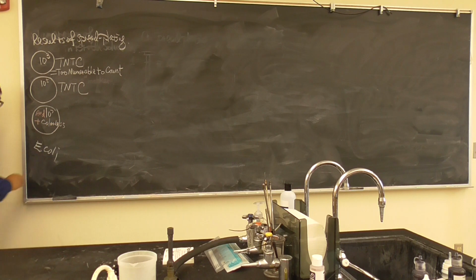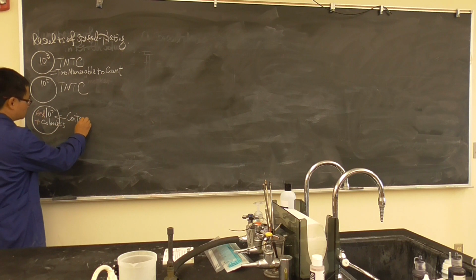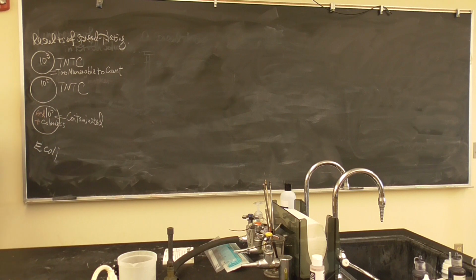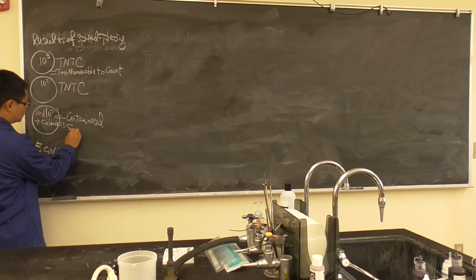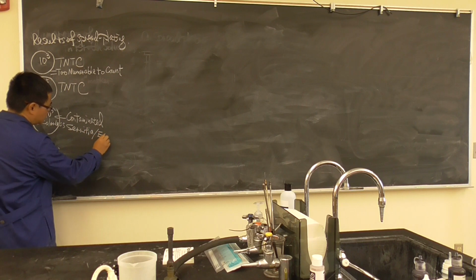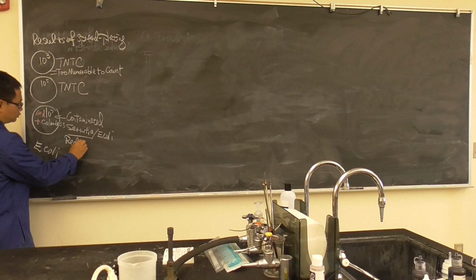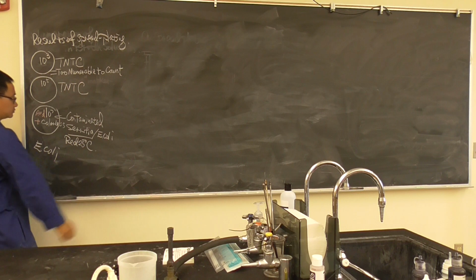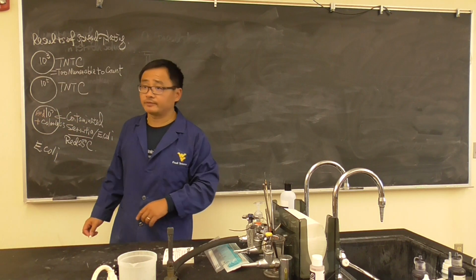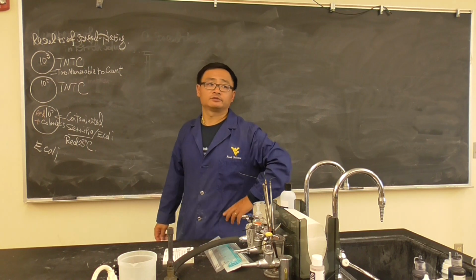What does this mean? Which means the plate is contaminated with 2 bacteria, Serratia and E. coli. Serratia, because this is red at 25 degrees Celsius, and we put it in the 25 degrees Celsius for 3 days. Okay? I want somebody to tell me what is your number at 10 to the 7.